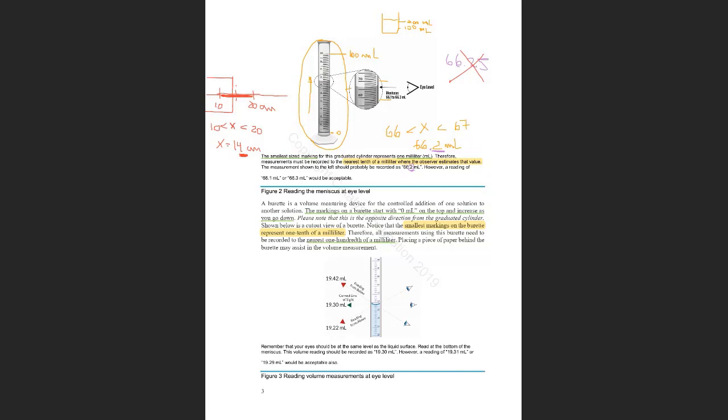I look at the smallest marking. Between the two markings, there are 10 centimeters. So I have to guess if it's 11, and does it make sense? Yes, it does. It just clicked.